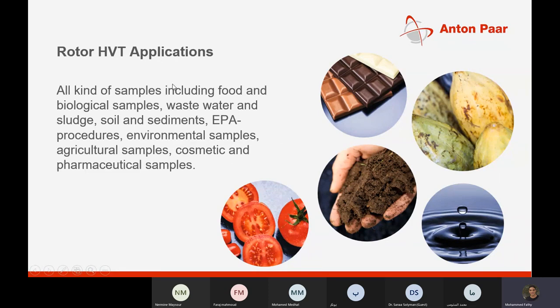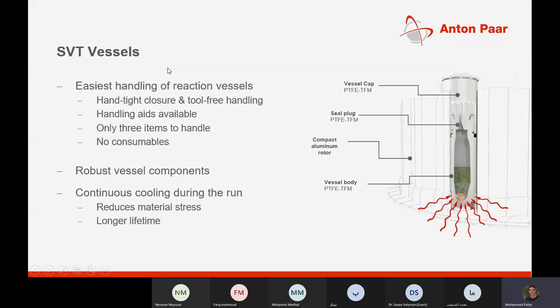The HVT rotor is mostly used for food, environmental, agricultural, cosmetics, and pharmaceutical samples. For petroleum, steel, and research applications, we focus on the SVT vessel, which also consists of three components with easy, tool-free handling. The vessel components are robust to bear higher temperatures and harder samples. SVT stands for smart vent technology.